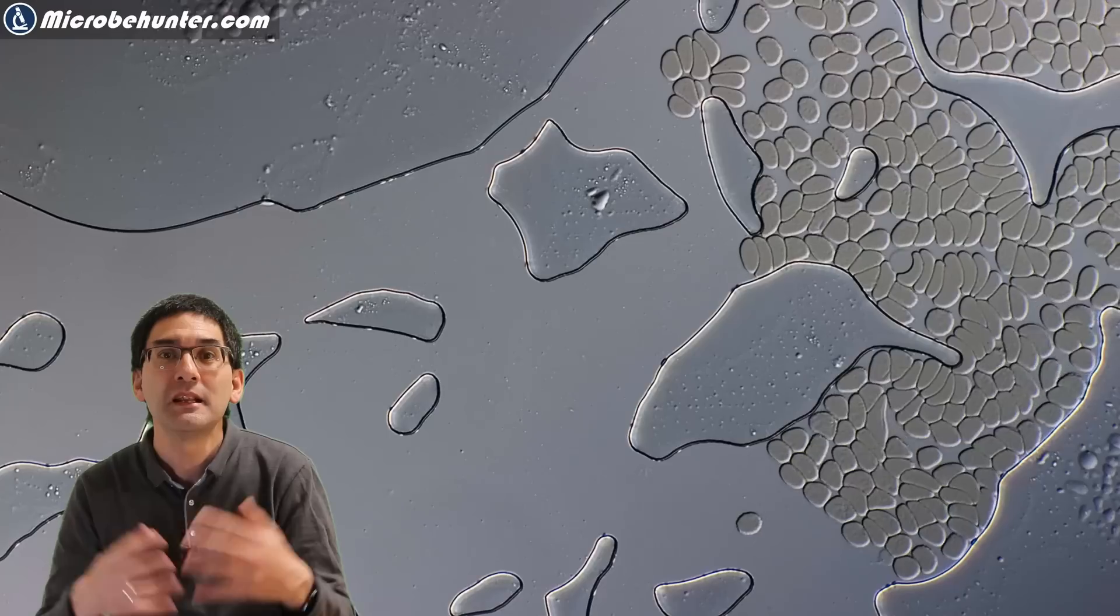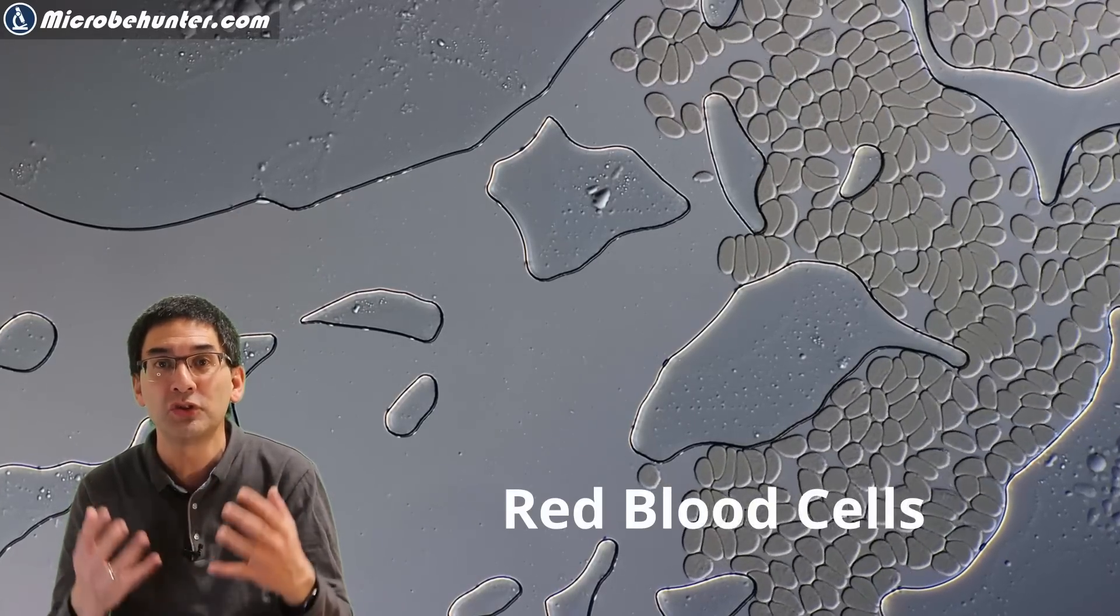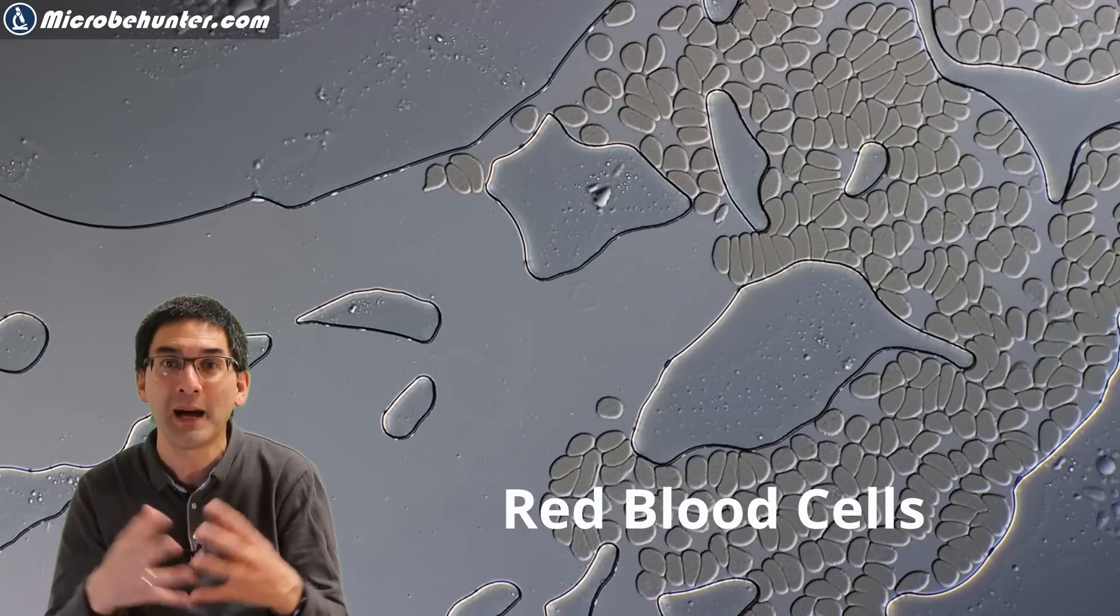However, those white blood cells that I'm going to show you, especially the phagocytes, they actively move around to engulf and eat up pathogens, these disease-causing microorganisms.